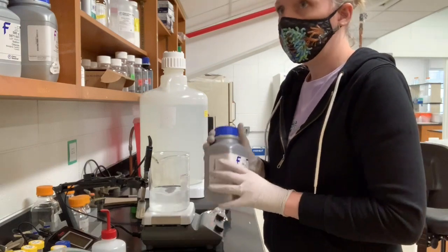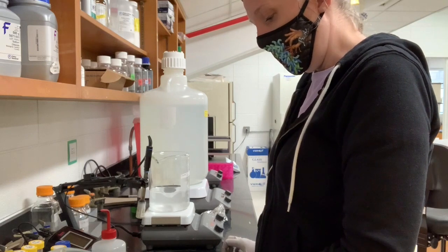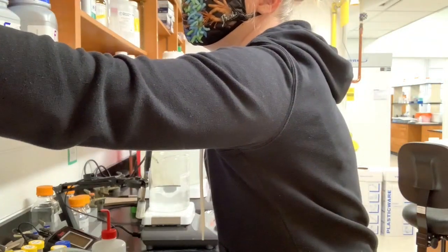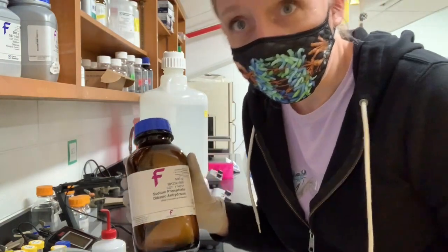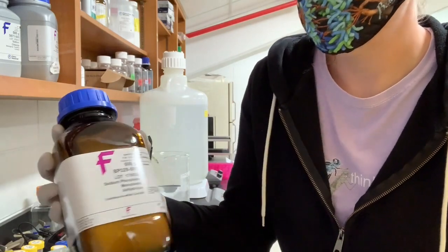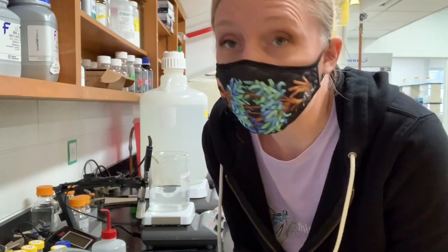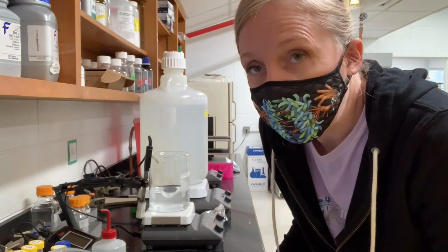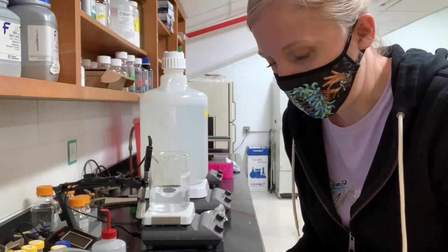The next thing on my list to add is Na2HPO4. We have two different sodium phosphate salts, and I'm going to show both of them to you so you don't make a mistake. There is a sodium phosphate dibasic and a sodium phosphate monobasic. The same will be true of the potassium phosphates: there will be a monobasic and a dibasic salt. So you want to match up really carefully the chemical formula you have in front of you with the chemical that you're going to use.